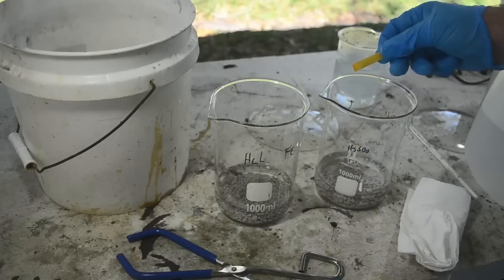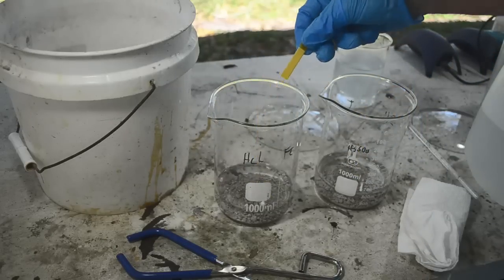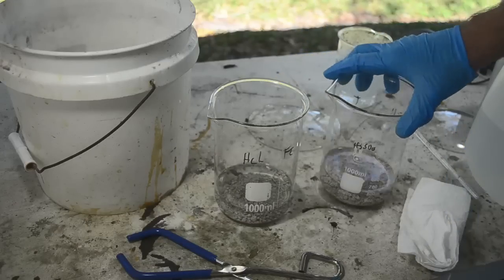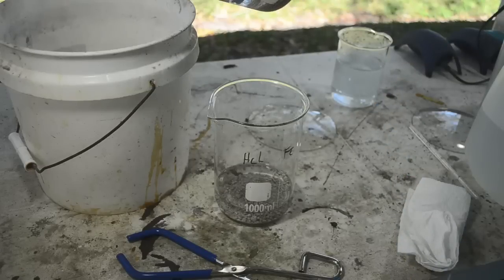Oh, just ever so slightly acidic. And I would say this one is neutral. So I'm going to give this one more rinse. And I would say that one, we are there. All right.